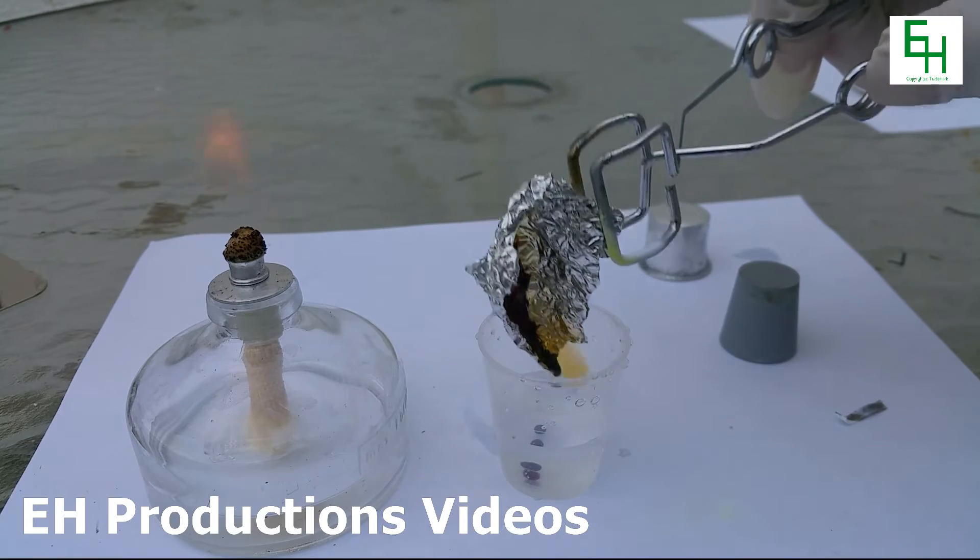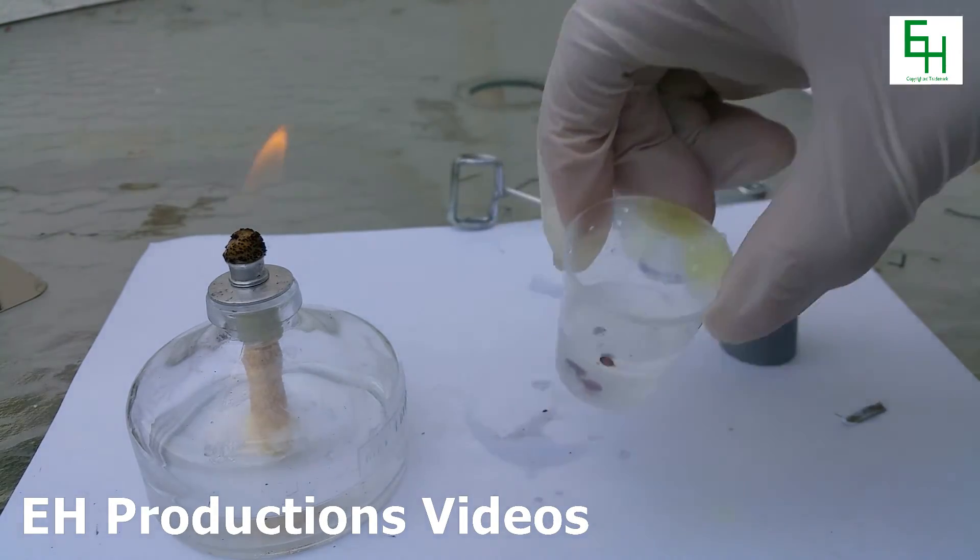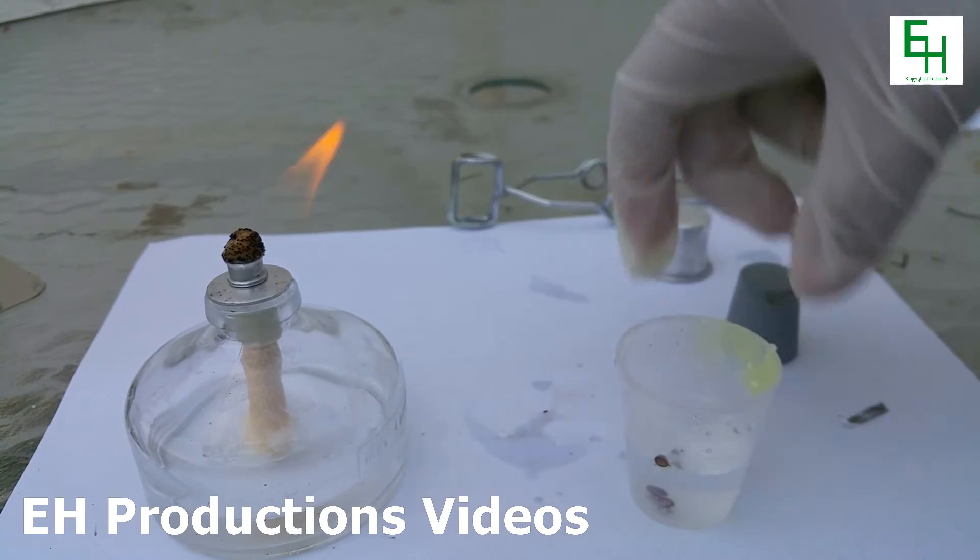And on the tongs you can see some sulfur. Alright as you can see we have made some plastic sulfur just like that.